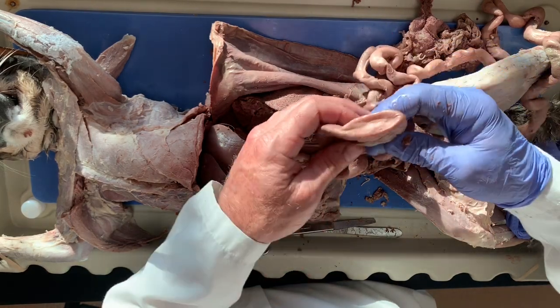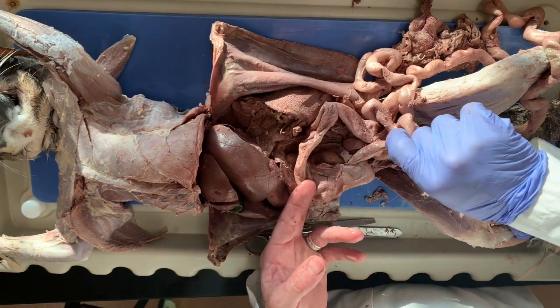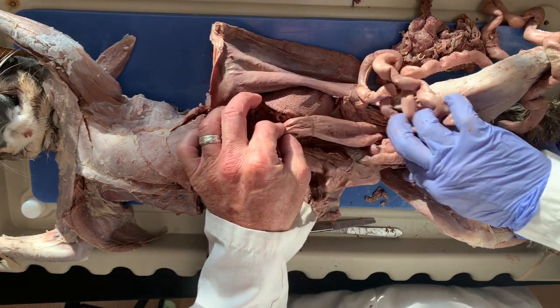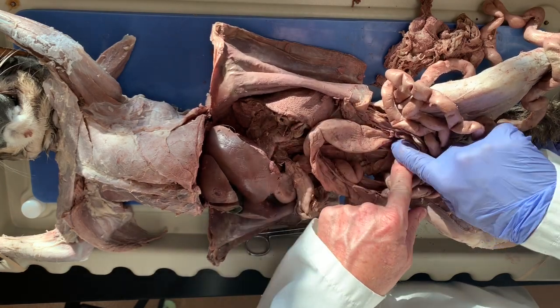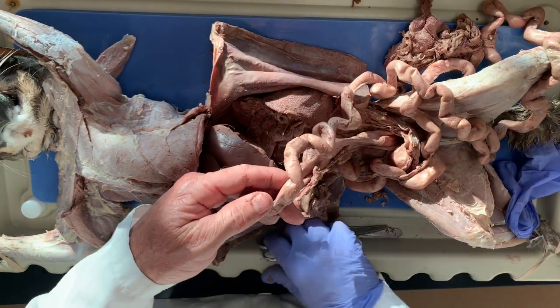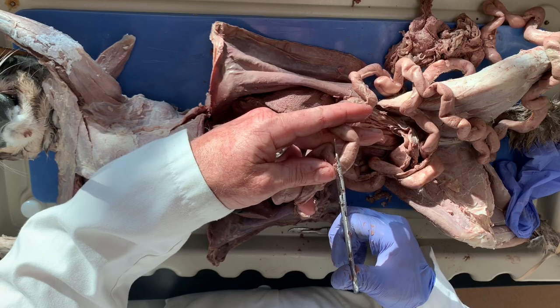So what I can do now is show you how it sits in the body. You have the ascending colon that comes away from the small intestine. You have the transverse colon that comes across the body, and the descending colon, which descends towards the sigmoid colon, which is the last kind of turn, and then down to the rectum. Okay, so I'm going to make an incision right here. And I'm going to cut, this is the ileum.